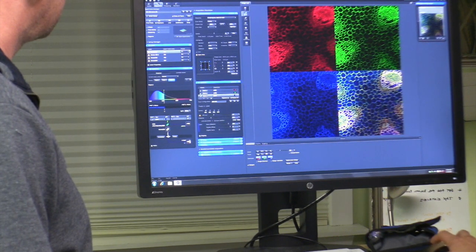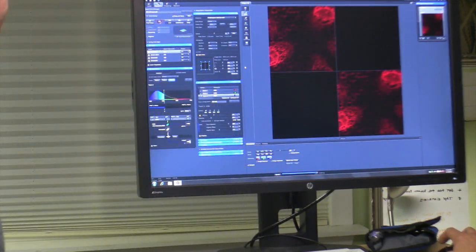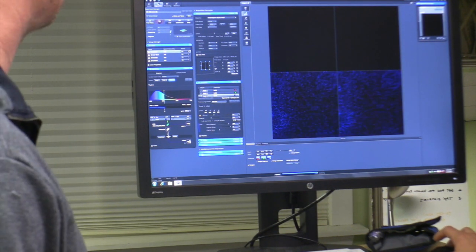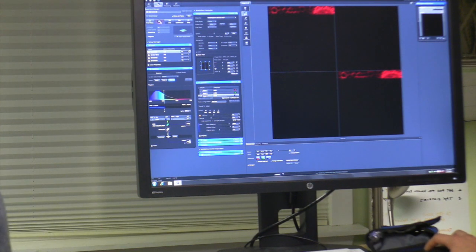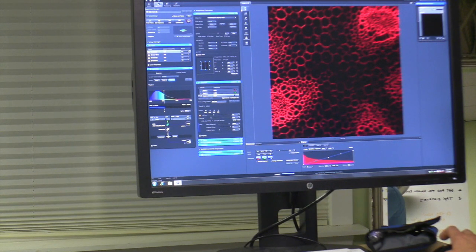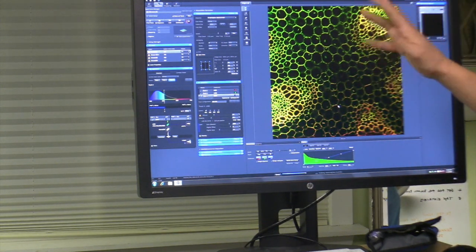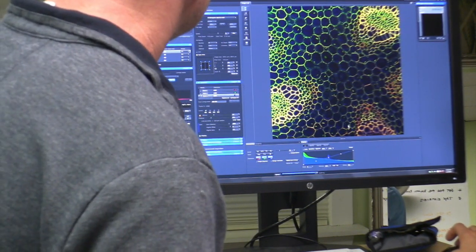Close the pinhole down. Let's do this one more time. Interesting. And this is just doing what a user might do automatically, just setting the exposure correctly and everything. It's just one more I did with the pinhole closed, to make sure the pinhole closes right and the acquisition is as good as it can be. So it looks good. That's how I would expect it to.